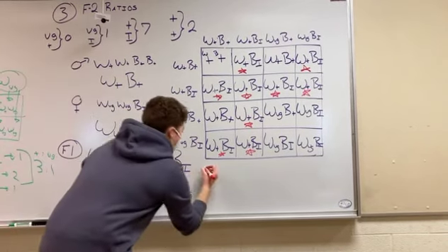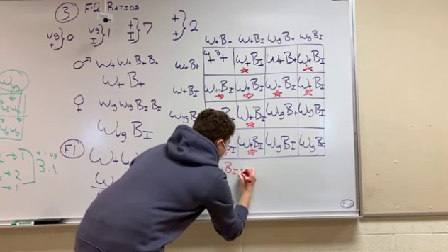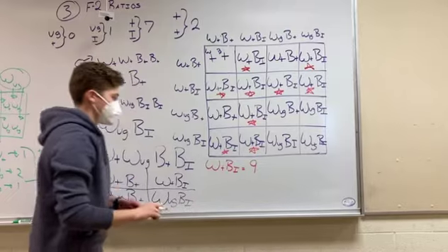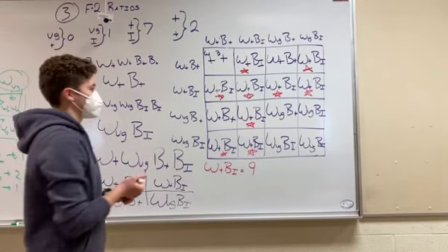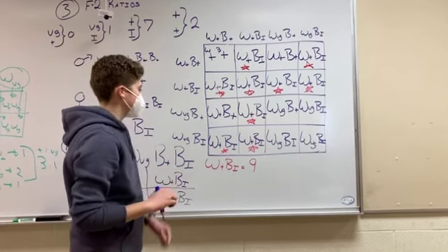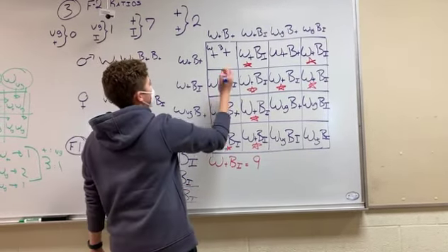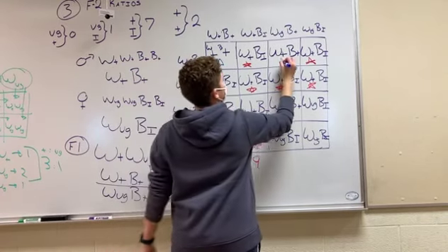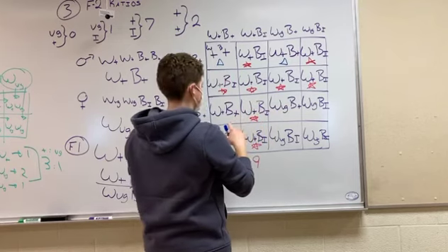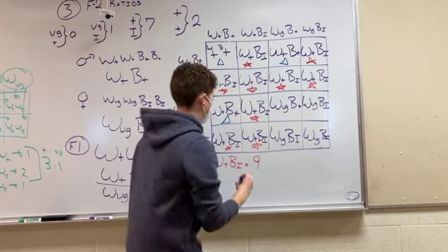Go ahead and write that. 9 wild type wings with yellow bodies. Let's change from a star to a triangle or some other shape or color. Oh, we got colors. Pick the next one that we're going to go over. Let's go with our wild types. Okay. 1, 2, 3 of those. Perfect.